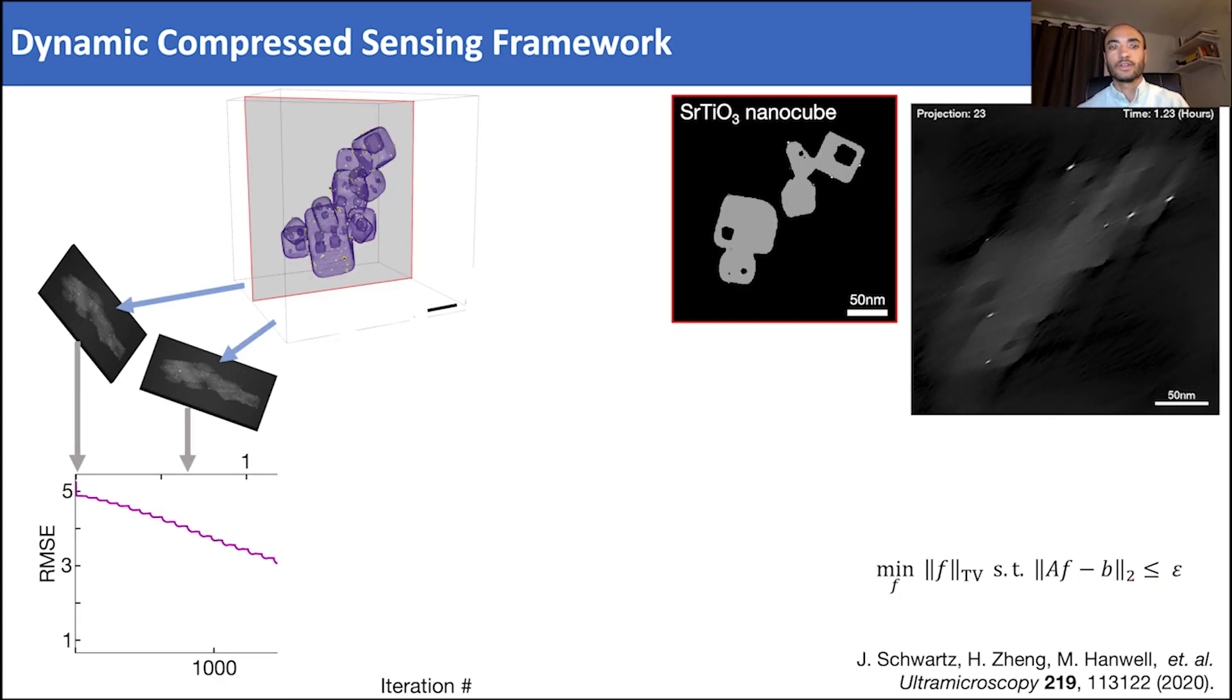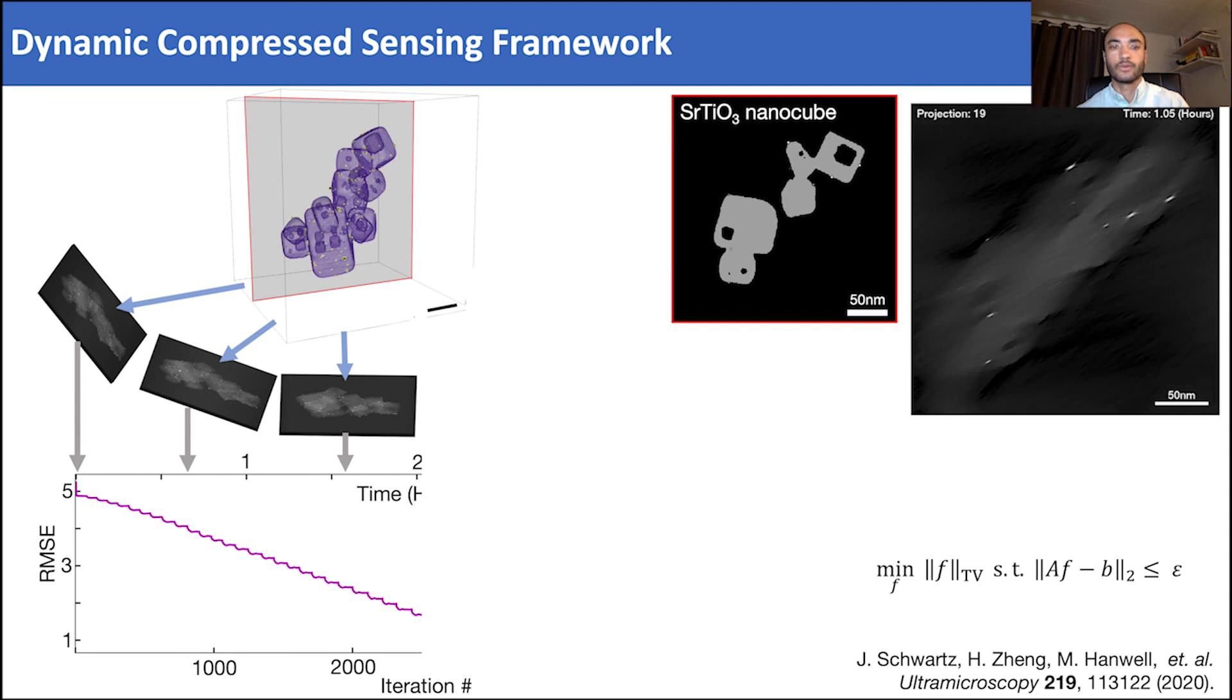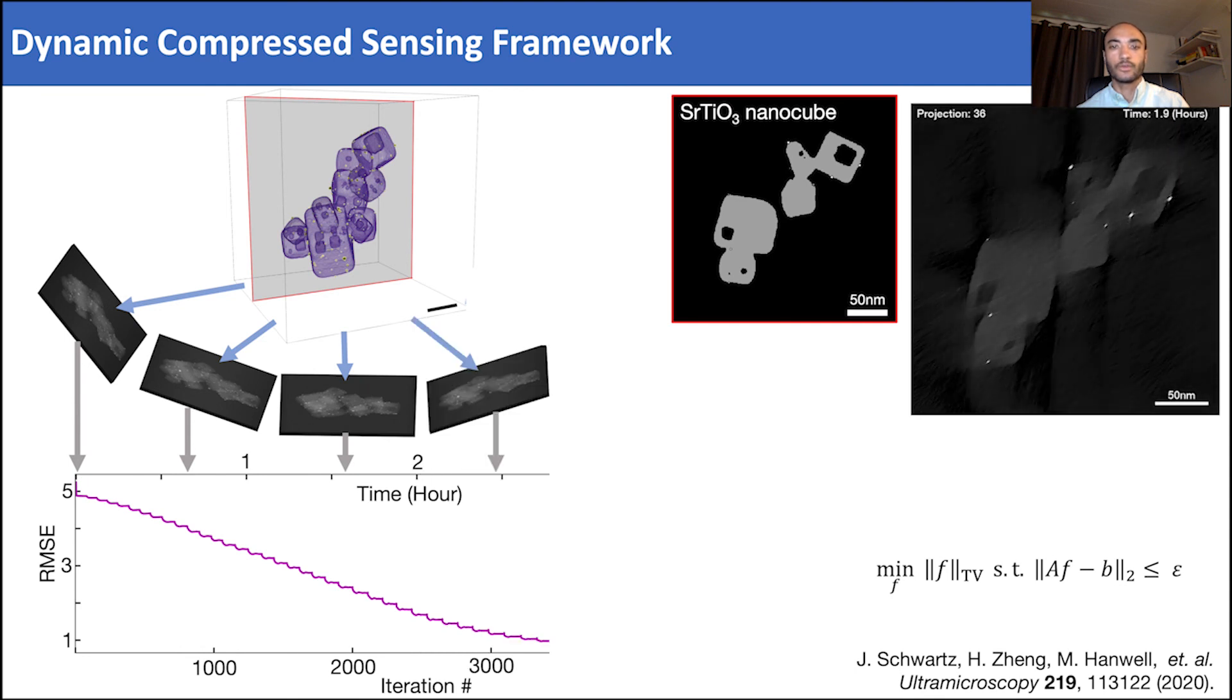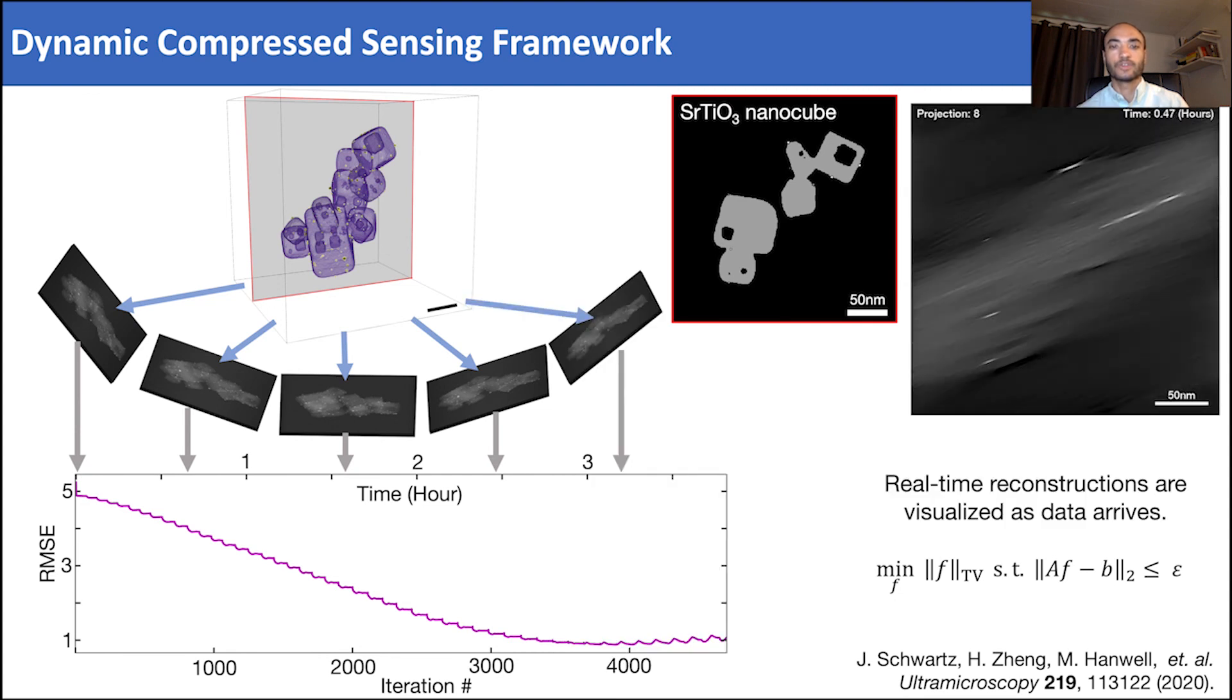TomViz also contains novel dynamic compressed sensing integrated within the software. Here, a real-time simulation is demonstrated on a strontium-titanate nanocube decorated with gold nanoparticles. Projections here are generated along a plus or minus 75 tilt range with 2 degree tilt increments, matching the experimental conditions from the real-time experimental demo. We can observe that the root mean square error descends downwards with a staircase-like pattern, indicating more projections are available. The incorporation of new information continuously drives the RMSE down, and the error converges as early as 70% of the experiment.